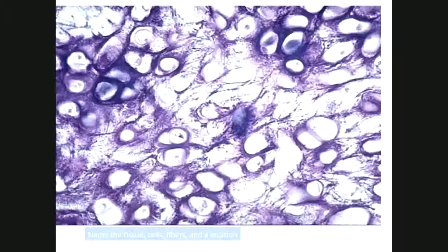All right. Leaving behind the hard tissues. This is an easy tissue, hopefully, because you see these circles, these blobs, these empty spaces. So these empty spaces here and here, and then in other areas, the empty spaces actually have a little resident inside. That one doesn't. This one does. Okay, the empty spaces are lacunae. The minute you see lacunae, you know you have cartilage. Because the lacunae of bone could not be seen. So visible lacunae is cartilage. So you have three possibilities.